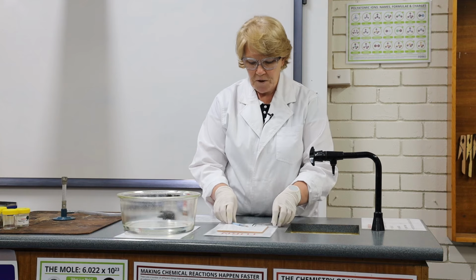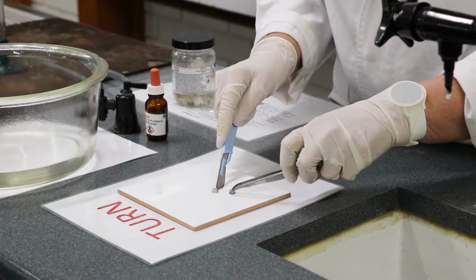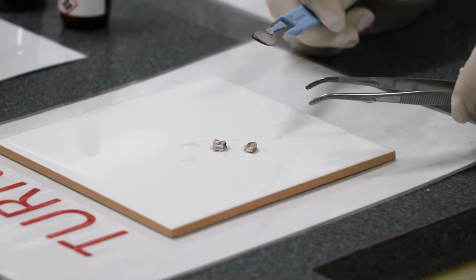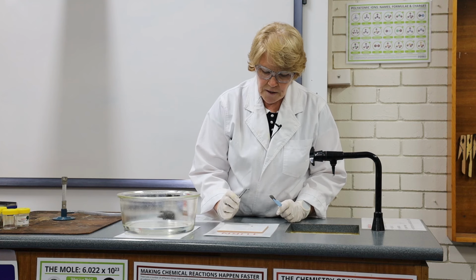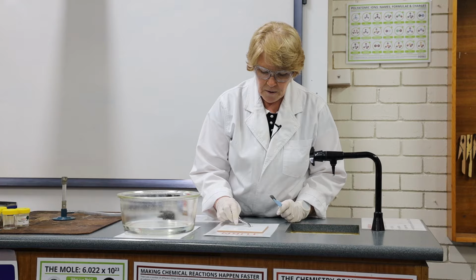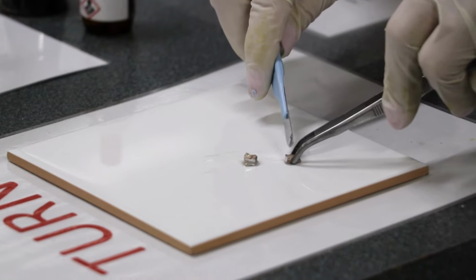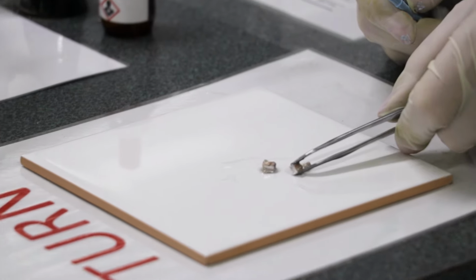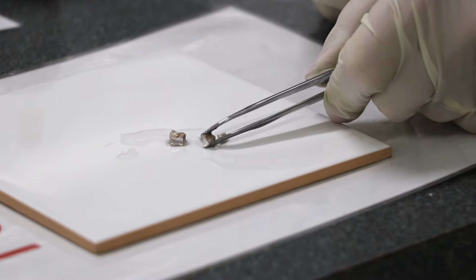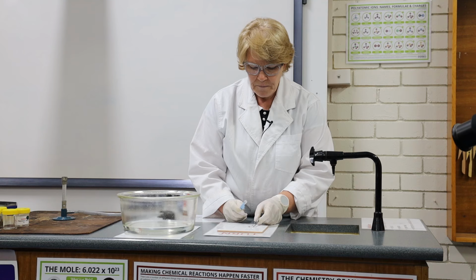Let's cut a fresh surface and observe it. Do you see that the fresh surface is quite shiny? It goes dull fairly quickly as the oxygen in the air reacts with it. I'm going to cut another fresh surface for you so that you can compare. Do you see how it's already become more dull in only a small amount of time? It's reacting with oxygen in the air around us, and that's producing sodium oxide.